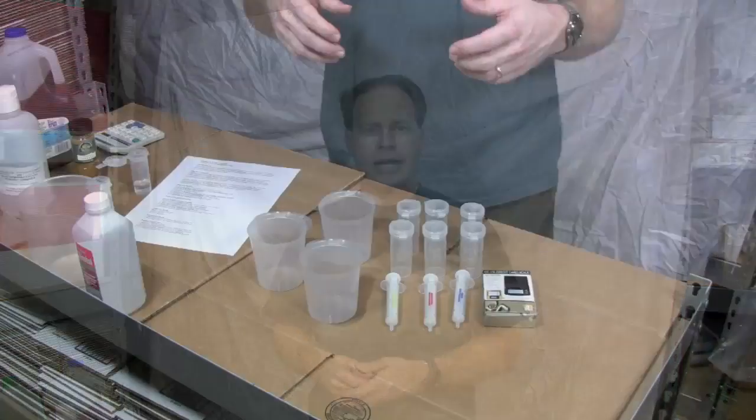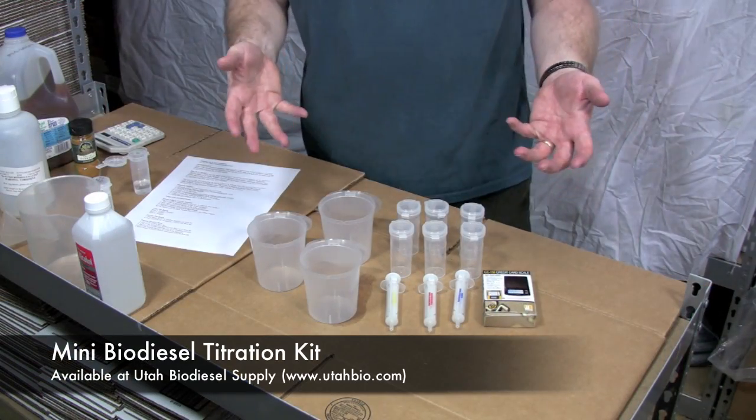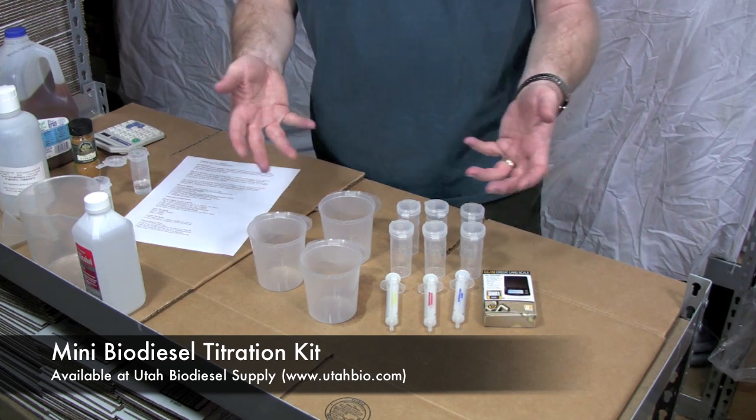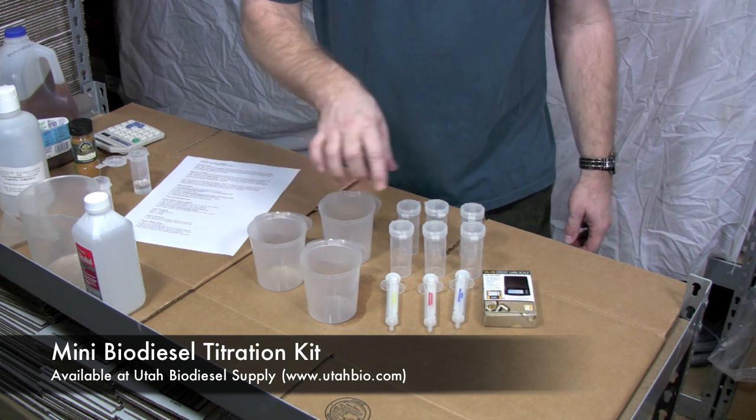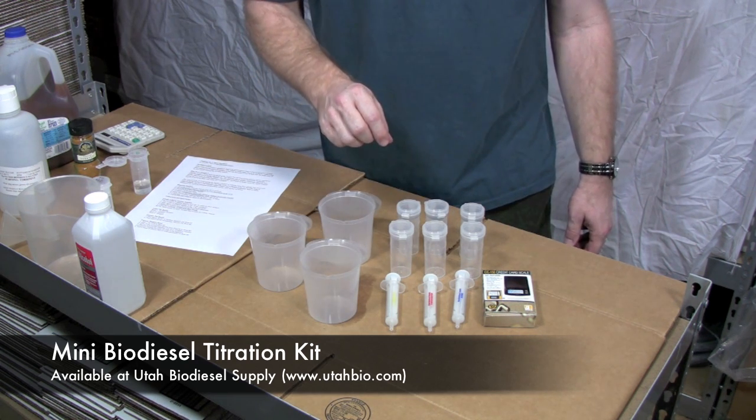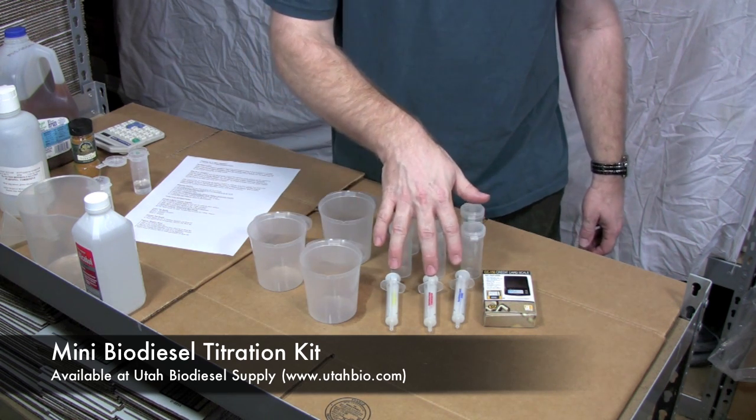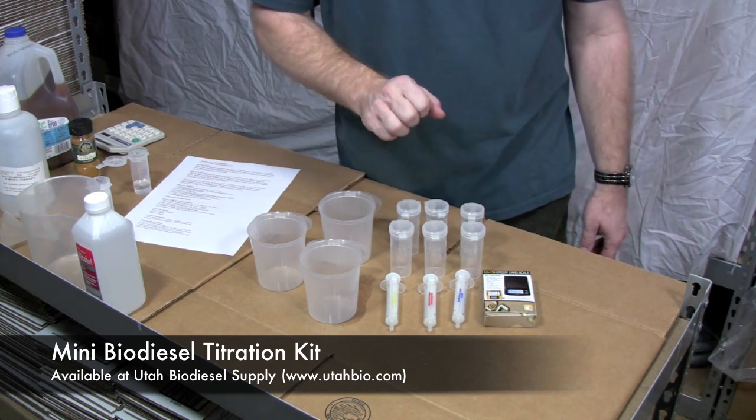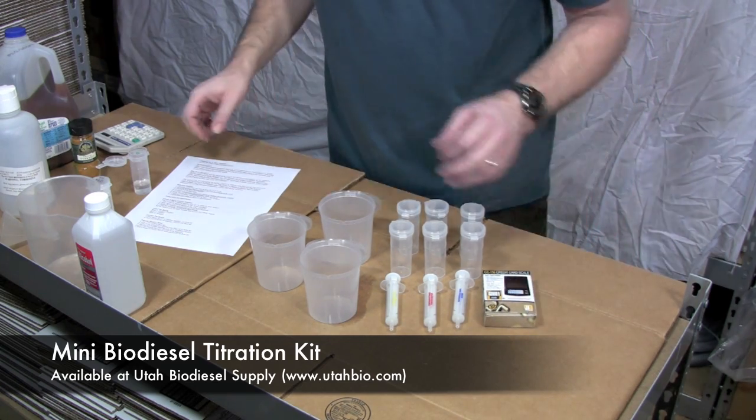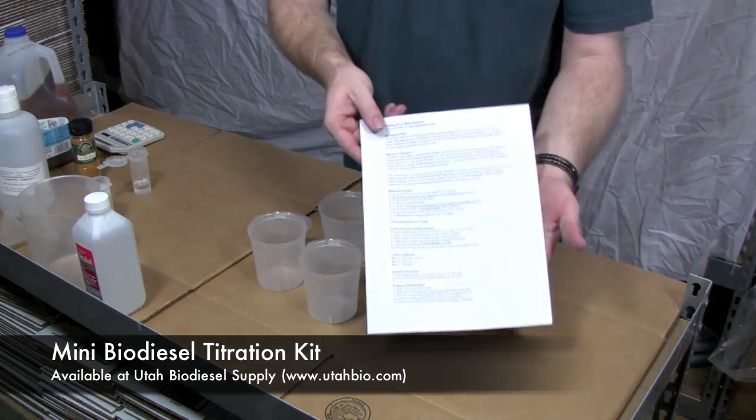I'm going to show you some of the things that we get in a kit from Utah Biodiesel Supply. Today we're going to show you our mini basic biodiesel titration kit which we'll be using today to do the titration. This comes with three jars to put your samples in, six vials to do the titration in, three syringes to test the oil, alcohol and titration solution with, a mini scale to weigh things out and a full set of instructions.